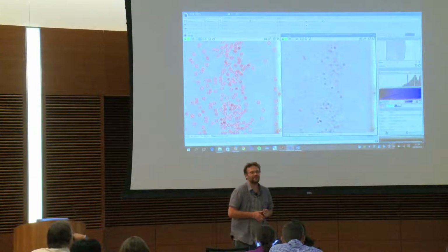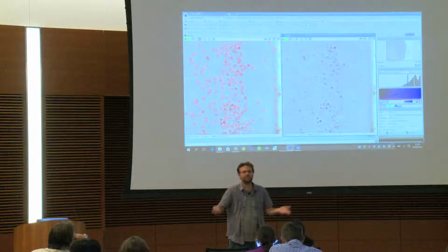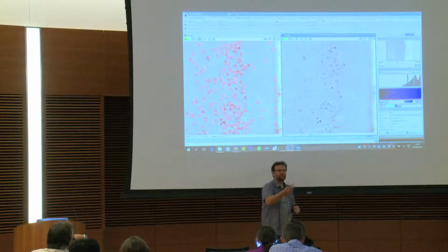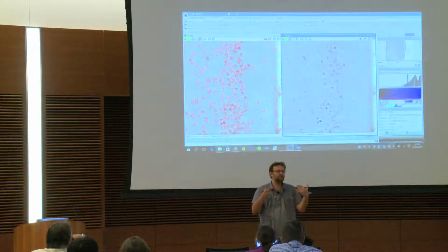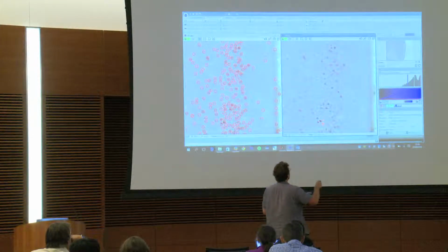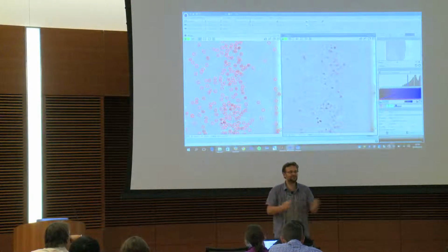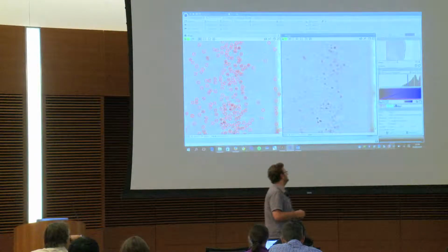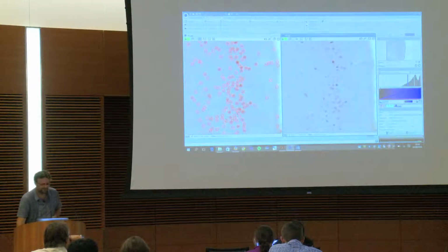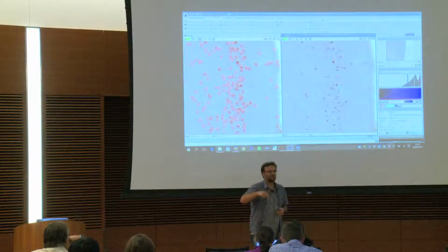So there is something that I do usually when I have time. I always have people that say, no, it's not working. So I put a paper here, and I ask 2 people to come and to agree on what they're going to detect. At the time they want to agree, they say, okay, I want to take this one, this one, this one, this one. So usually I'll take the boss and the trainee. And the trainee says, yes, boss, okay, I will do it. And then I move my image a little bit, like that, and I say, okay, so there is a new problem because you didn't discuss this one, you discussed the previous one.